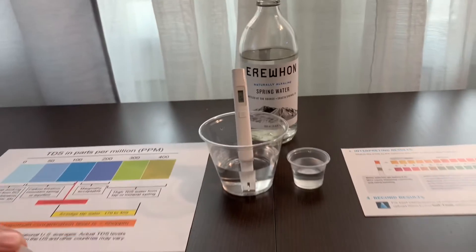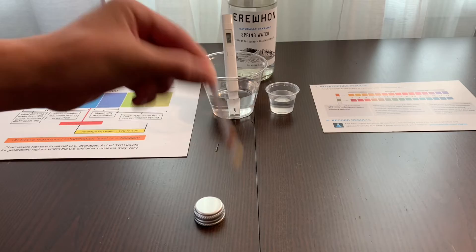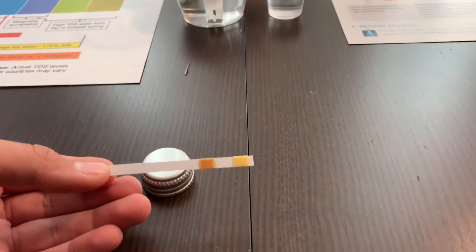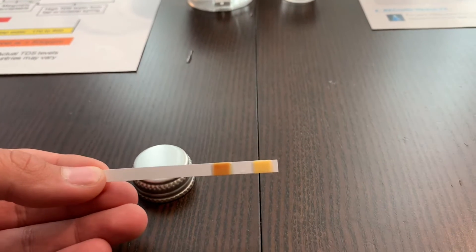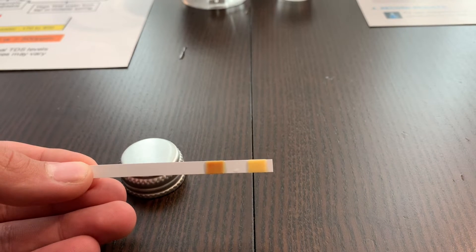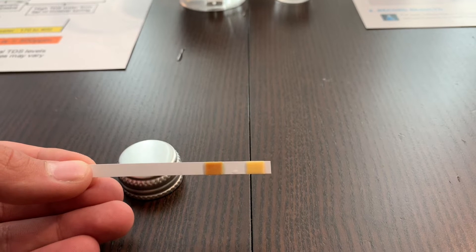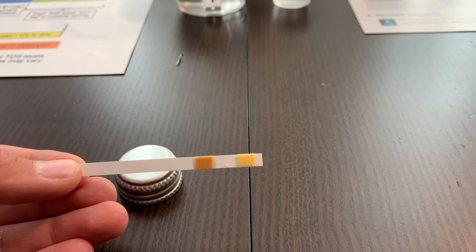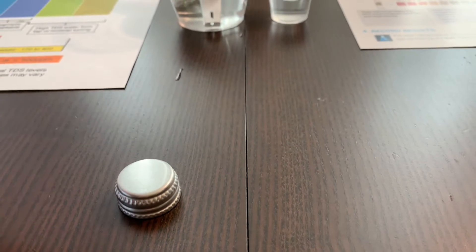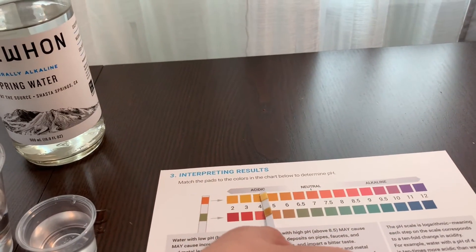Now, we need to remove it from the water and remove the excess water. Now we wait twenty seconds to interpret the results. Now, let's compare the strip to the result on the color chart.